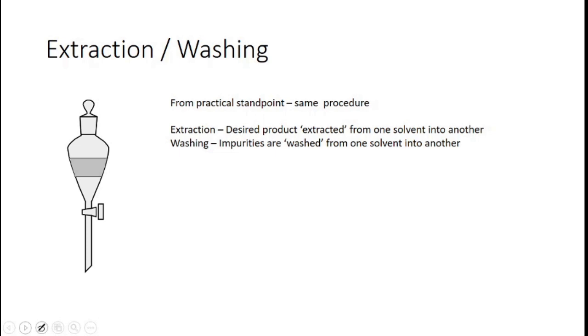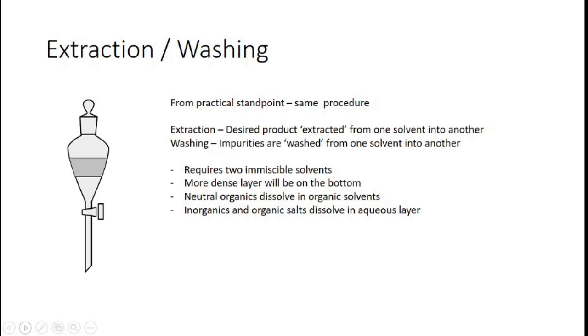A few points about extractions or washing. It does require two immiscible solvents. So you cannot extract from an aqueous solution, for example, with ethanol. As you all know, ethanol and water mix. If you buy a beer or some other drink, you do not have a water layer and an alcohol layer. They are combined. They mix. So you cannot do an extraction with those. The two liquids cannot dissolve in each other.